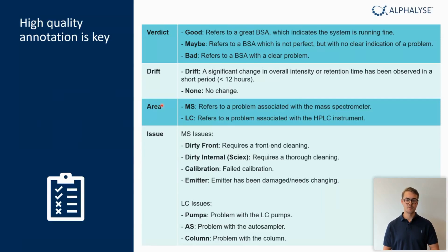So we set up a lot of different parameters and really thought a lot about it. And then we started annotating all of these samples which we're running. So we actually spent a lot of resources on this. And one of the main important things about this is actually the consistency of these annotations and having some clear guidelines for how you're actually going to do this. And then safety in numbers, you really need to get a lot of data for this. This is one of the key things for training these models. The more data, the better.